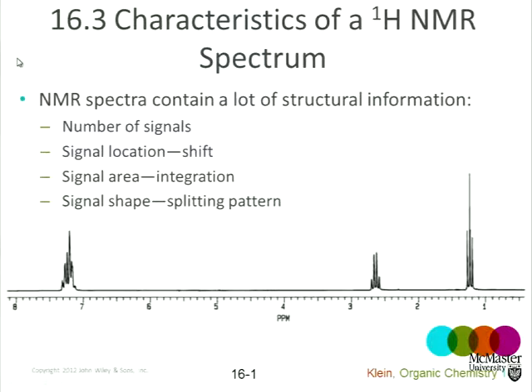So, proton NMR works the same way. Proton nuclei have spin. Put them in a magnetic field, the spin states separate in energy, and we can measure the resonances for different protons. And different protons have different environments. They may be more or less shielded by the electrons around the nucleus in a sample.